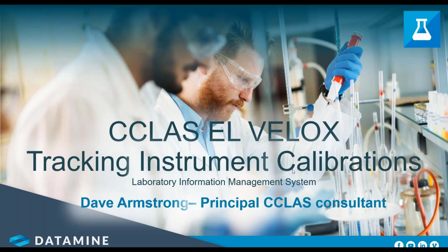Today, we're going to be considering the use of the Velox model to allow calibration events to be created, stored, and managed. Now, this is delivered as part of the CCLAS EL Velox solution, but this and all the other webinar presentations we've done along this line, all of this functionality can be retrofitted into existing CCLAS EL systems.